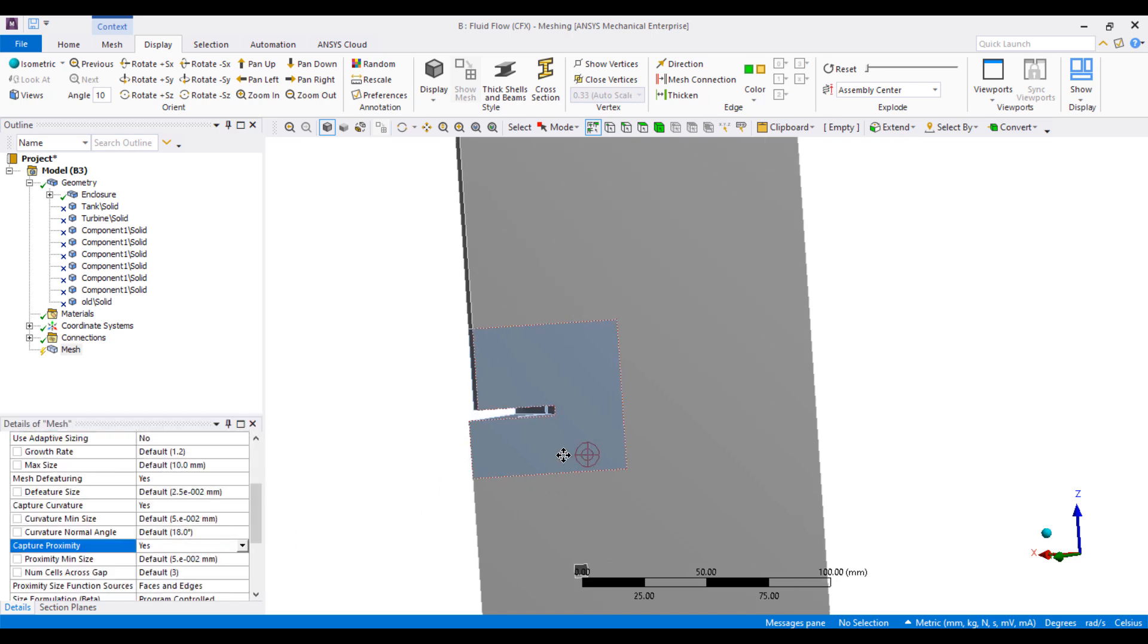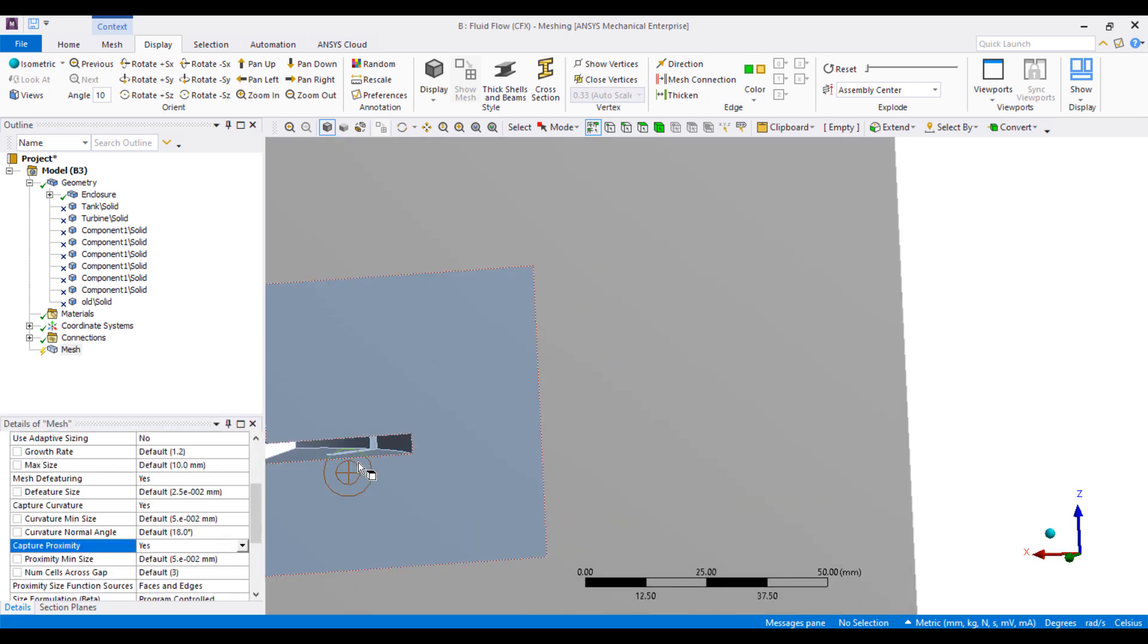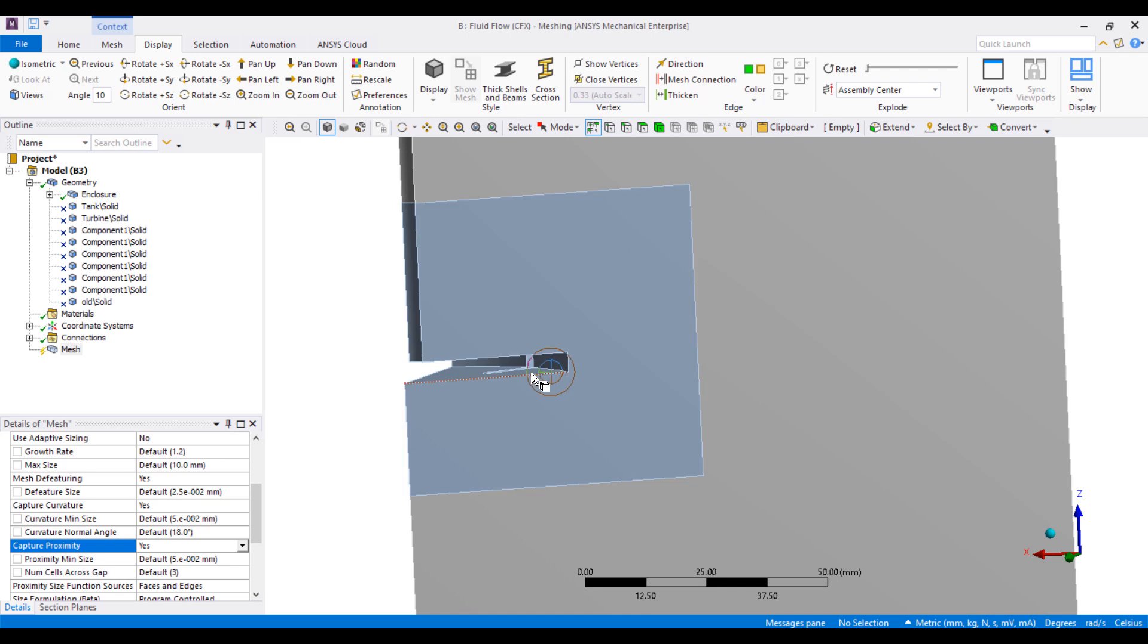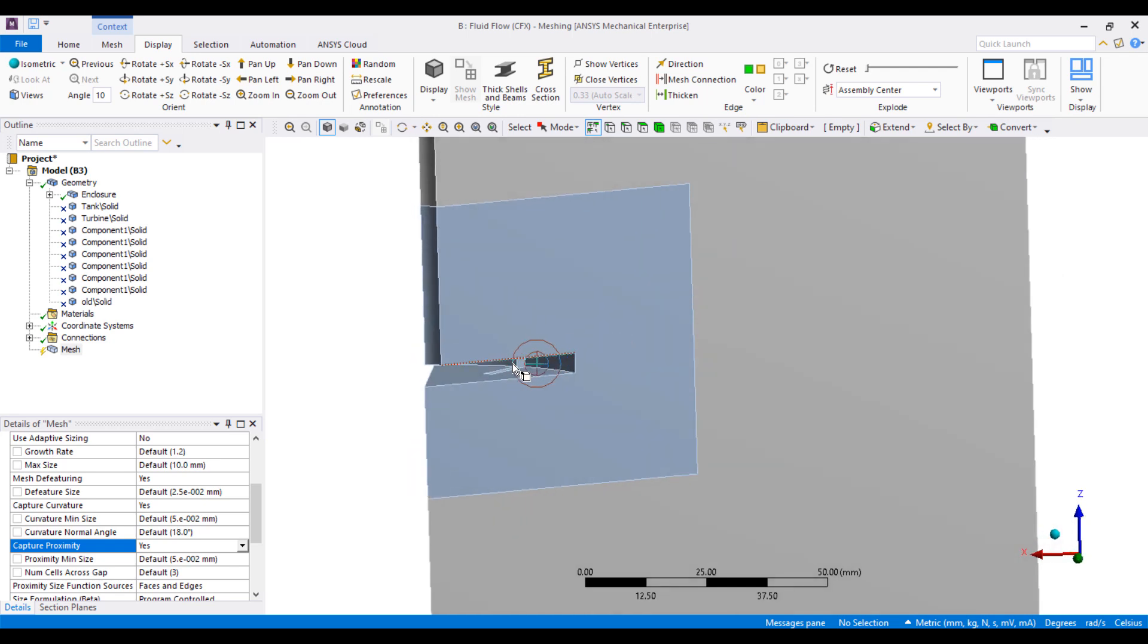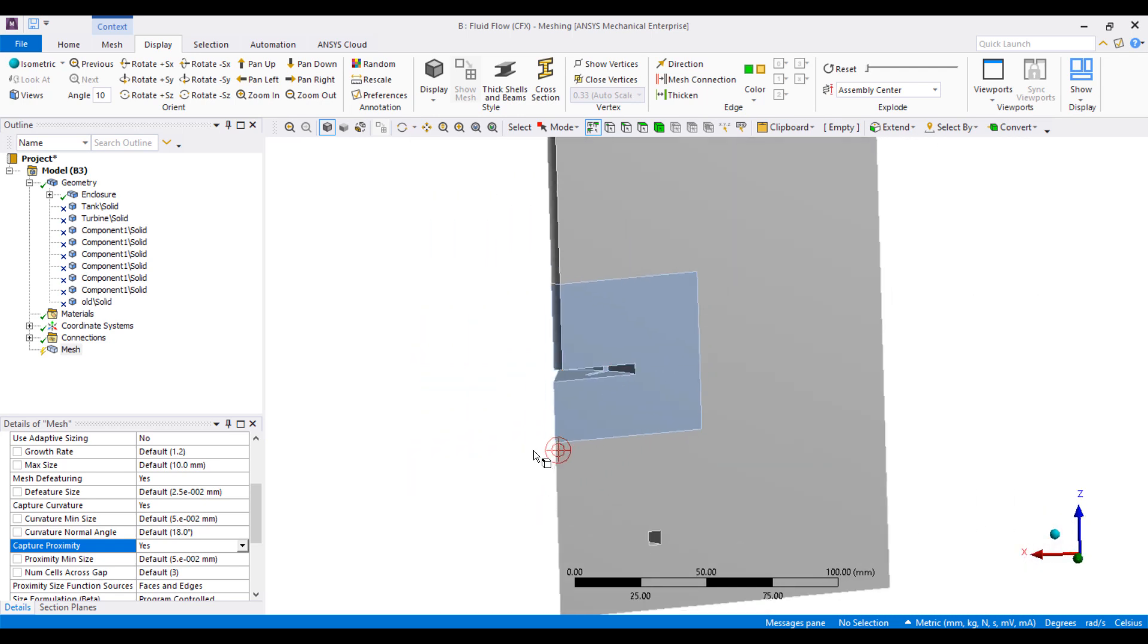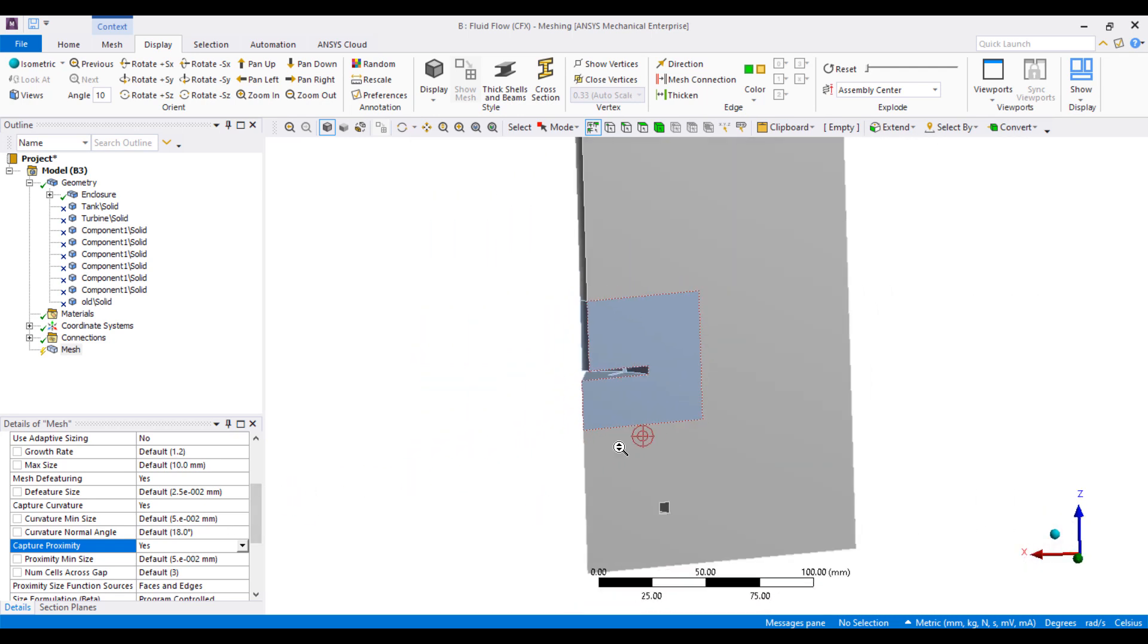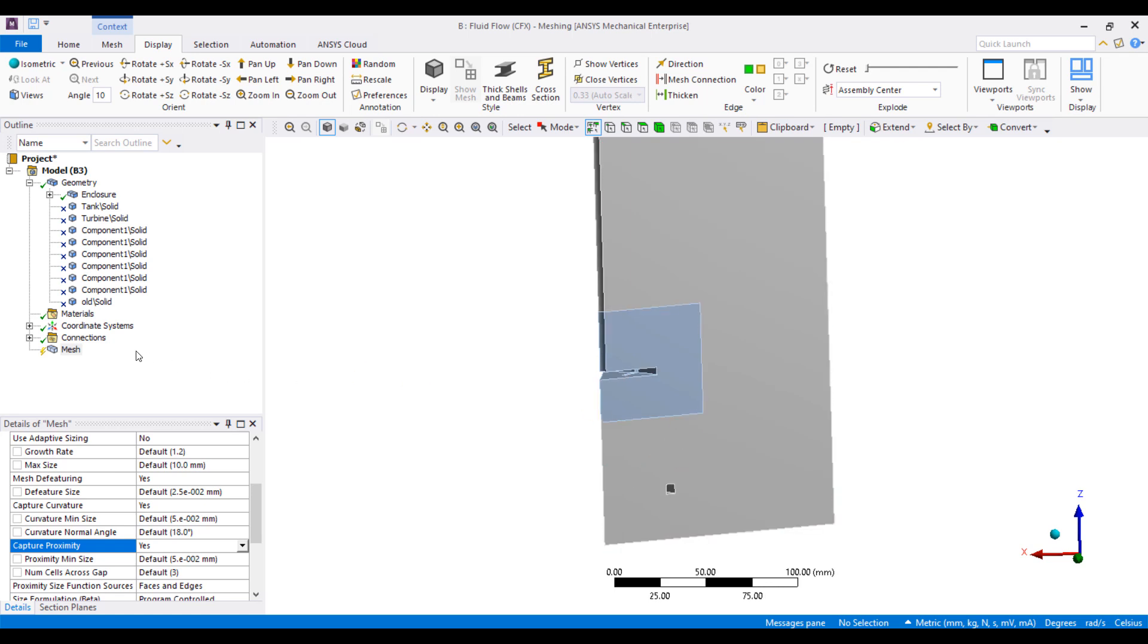Set this to three, which means that any small hole, small region, will have at least three elements across the thickness, across that gap. And finally, we'll add some inflation layers to this model.